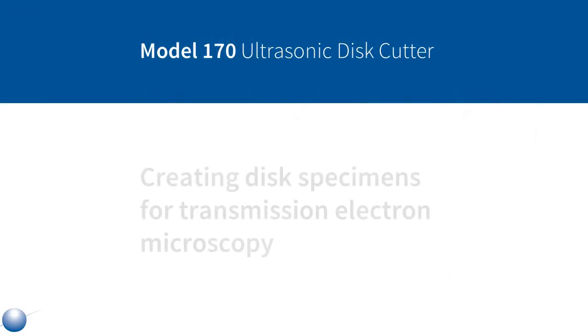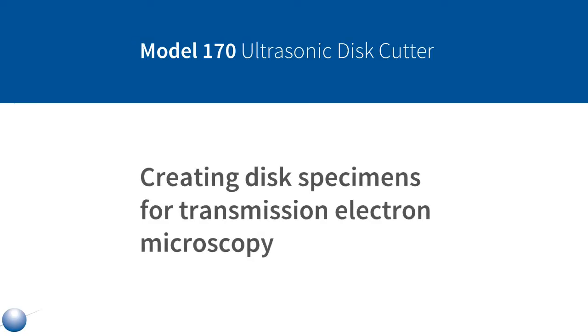In this video, you will learn how to create disk specimens for transmission electron microscopy using the Fishone Instruments Model 170 Ultrasonic Disk Cutter.